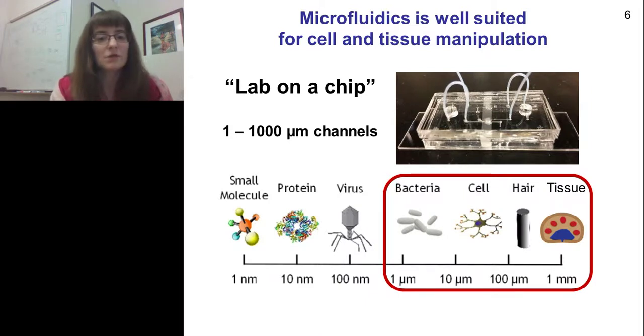And then that leaves you with all of the lower range of microfluidic length scales, like tens or hundreds of microns, to control the environment of the tissue. So we're able to, for example, deliver streams of fluid locally to subunits of tissue or to connect multiple tissues together. And those are things I'm going to share with you later in the talk.